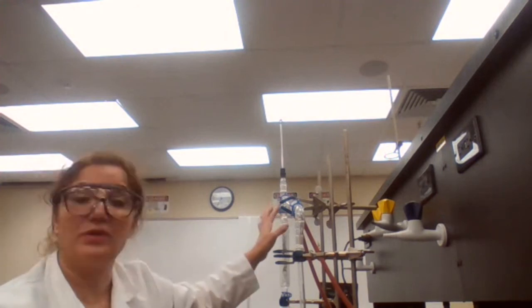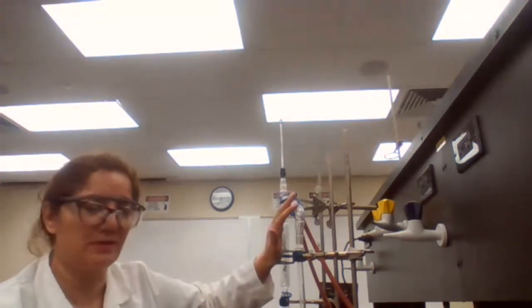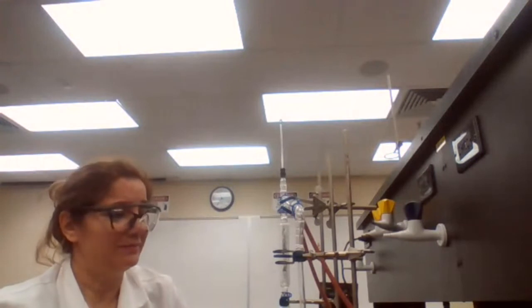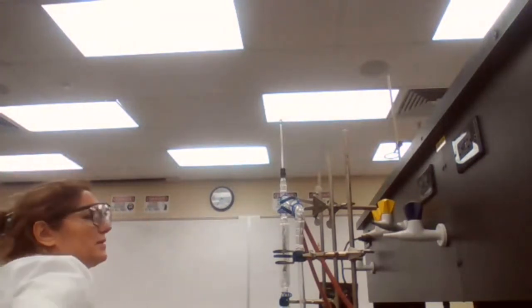And why the drop in temperature? Because there is no vapor of the lower boiling point compound up here anymore, because that went to the condenser and we recovered it as liquid. So there is no vapor for a short time. For a short period of time, we don't have any vapor around the thermometer, so the temperature is going to drop. So if you see a drop in temperature, don't panic. That's what's happening there.